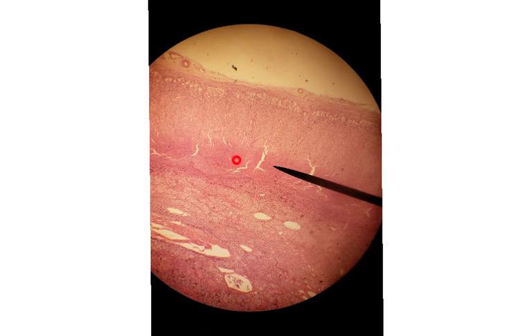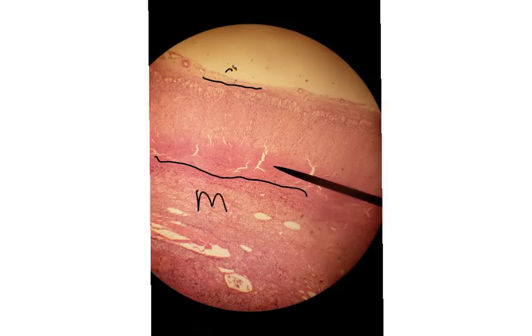And we can see we've got a dark pink right above it. We've got a light pink. And then we've got an area right here that kind of looks like it's almost bubbly, I think. So, those three areas make up the adrenal cortex. Now, this is probably the most confusing part because there's a lot that goes on in the adrenal cortex. And each layer has its own name. So, I'm going to draw some lines here to help us separate each layer. Here we said was above this line the capsule. Below this line is the medulla. But between these lines is the cortex.